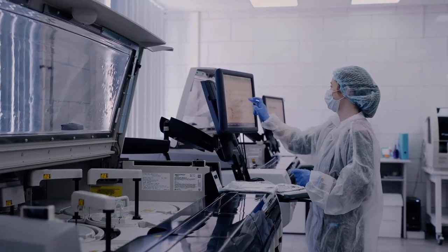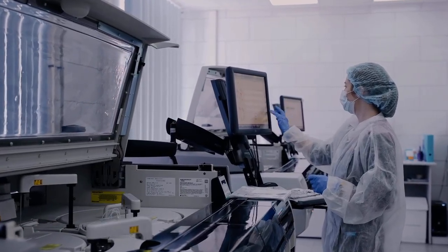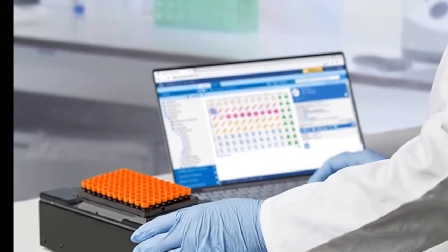When sample tracking gets complicated, FreezerPro keeps it simple. See how easy it is to integrate FreezerPro into your sample management workflow with this intuitive, user-friendly interface.